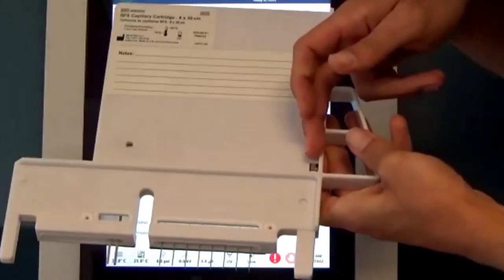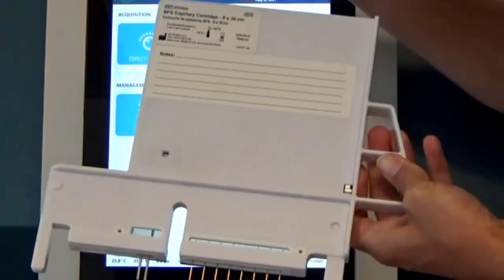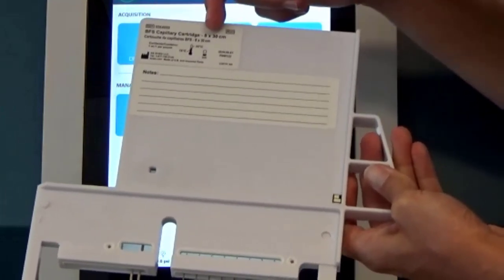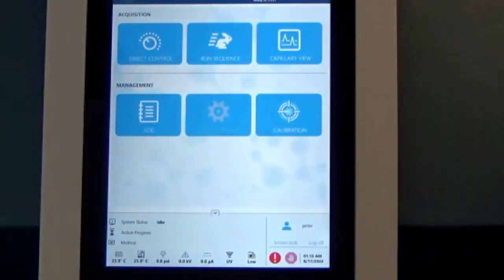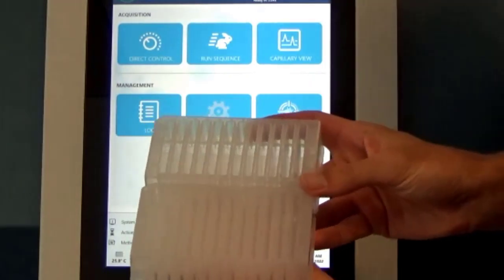Right here is our RFID chip. That's where all that sample information or cartridge information is stored. You also have some of that same information up here, the type of capillary, storage condition, part number, etc. We can put that away. Next thing we're going to look at is our plates.